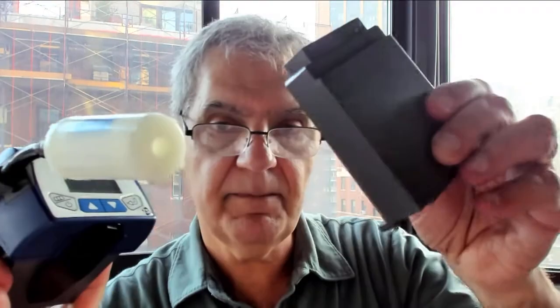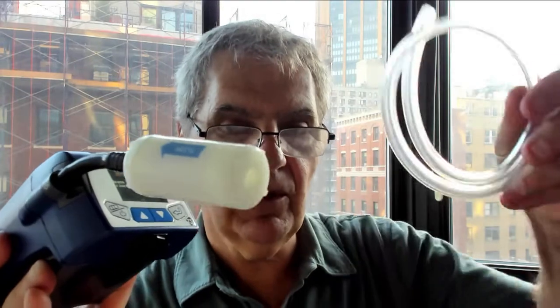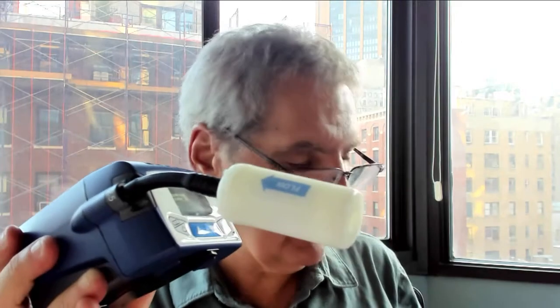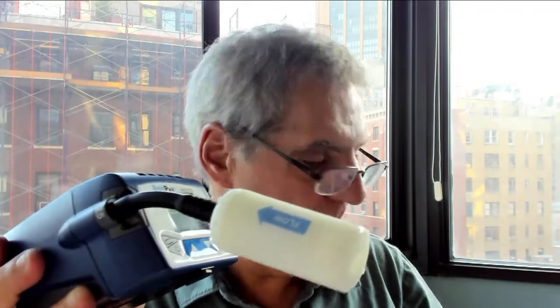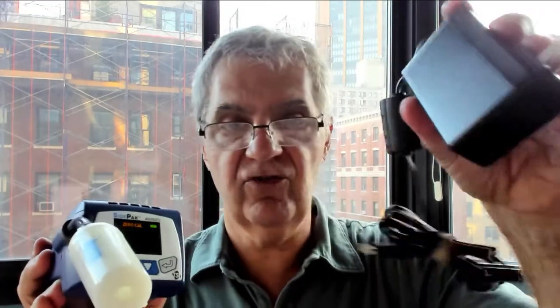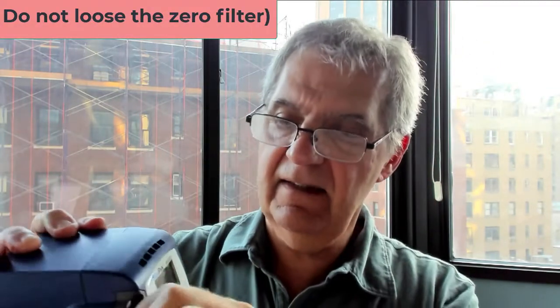I'll give you an extra battery — you may want to charge it. I'll also give you a longer hose in case you want to put the device in your knapsack and have the hose coming out so you can sample without making a scene in the subway. I recommend hiding it if you're doing that kind of sampling. Other accessories include a little tripod if you want to set it up somewhere, and of course a charger, which plugs into the port on the back.